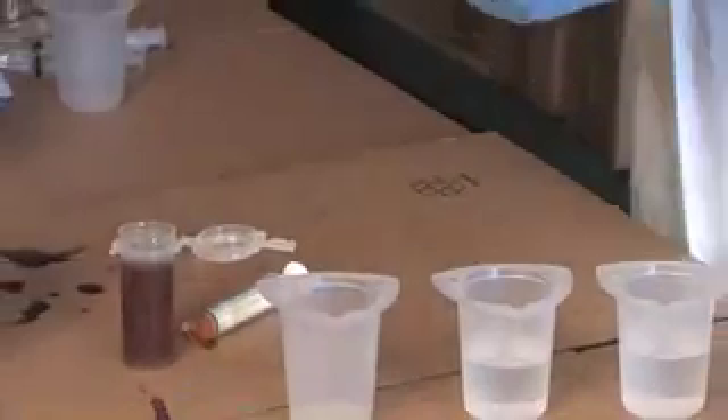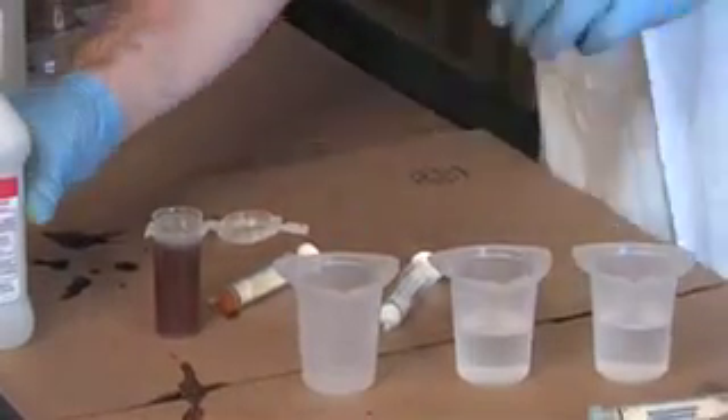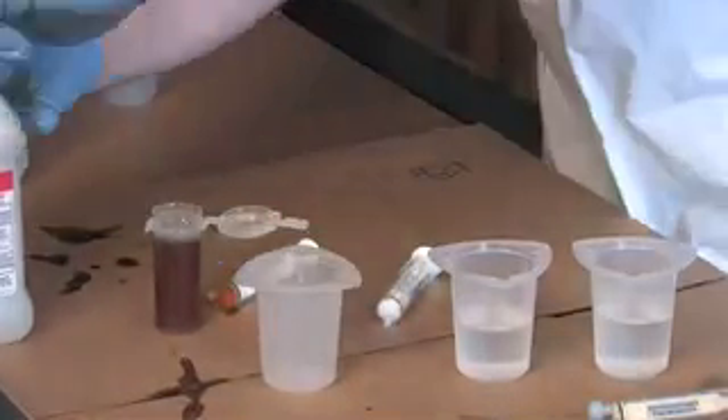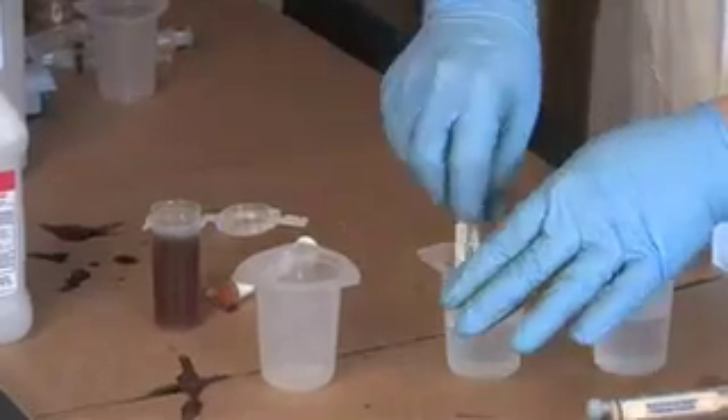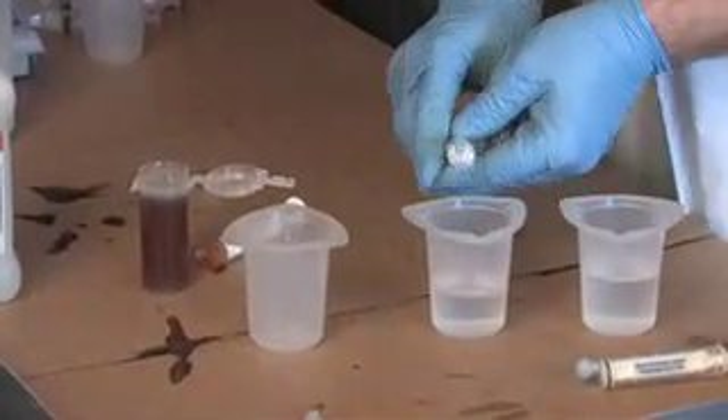Before I put that in my solution, I'm going to put 10 milliliters of isopropyl alcohol in here. These containers have handy measurements on the side, but if you don't have that you can suck up 10 milliliters with a syringe. Get rid of your bubble.